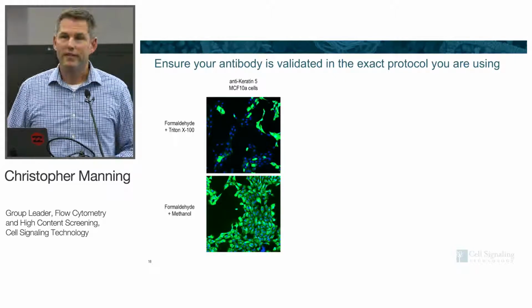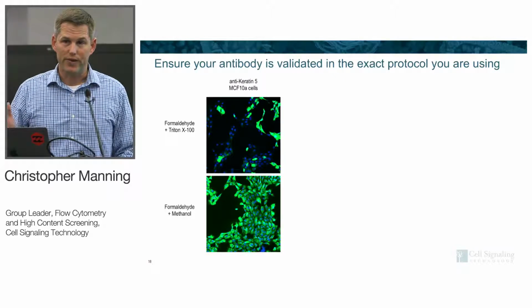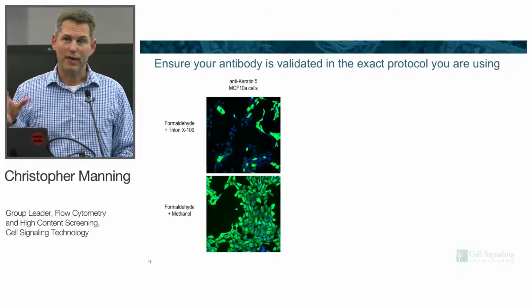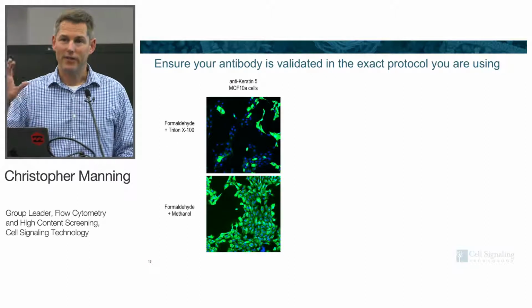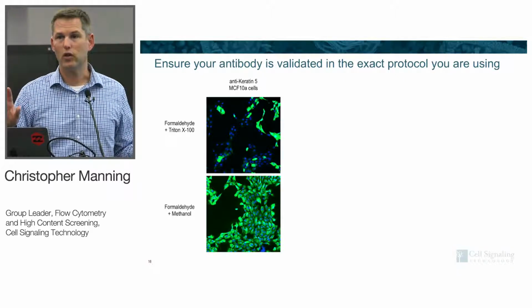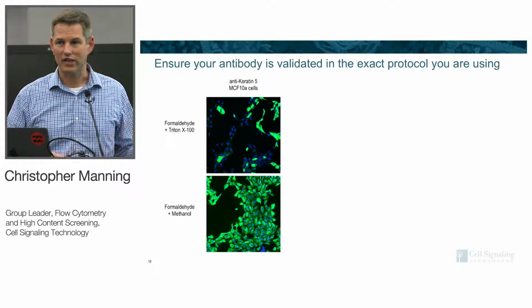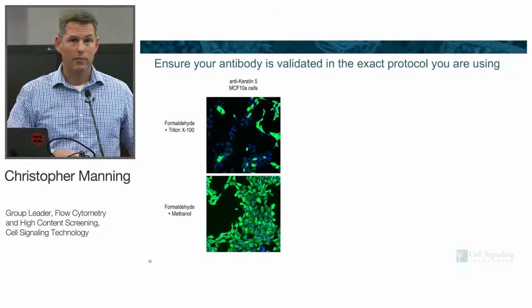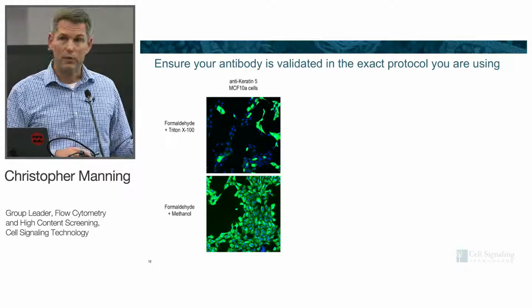So ensure that the antibody is validated in the protocol that you're using in your lab. And we understand there's a variety of protocols out there. I'm not knocking them, but we just want to emphasize that it's not a guarantee that you can take an antibody, and just because it's flow validated or validated in any other application, doesn't mean that it's going to work in that application no matter what you do in your lab. So it's important to make sure that you're following the established protocol.